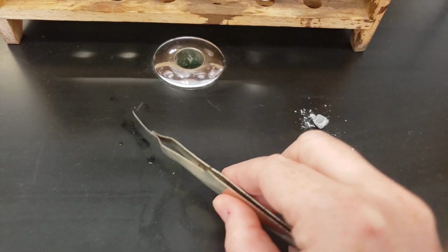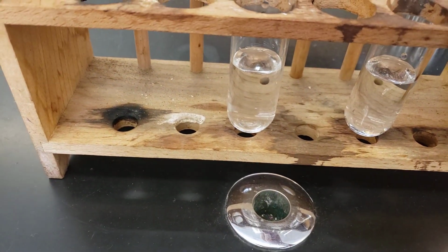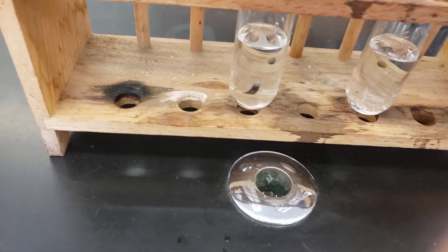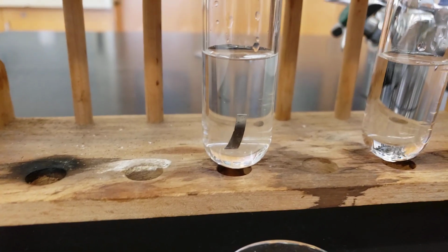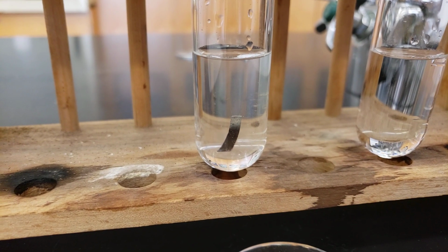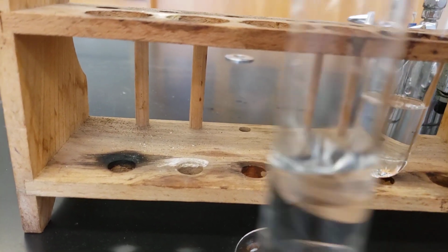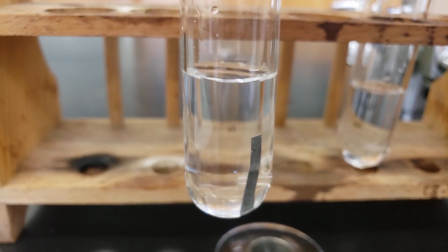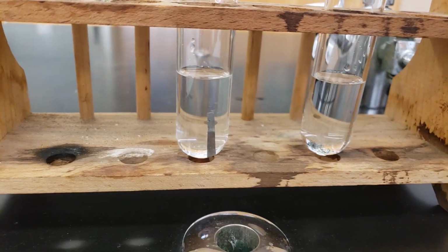So up first, I'm going to grab my stick of magnesium and I'm going to drop it into the water, make sure it gets down in there. And as it gets down in there, we see a whole bunch of nothing is happening. It's just chilling out. And even if we take it out and give it a good old-fashioned swirl, nothing appears to be happening. So magnesium isn't reactive in water.